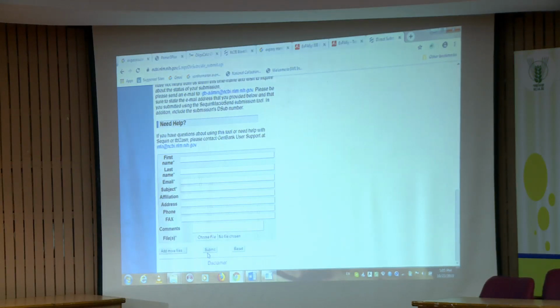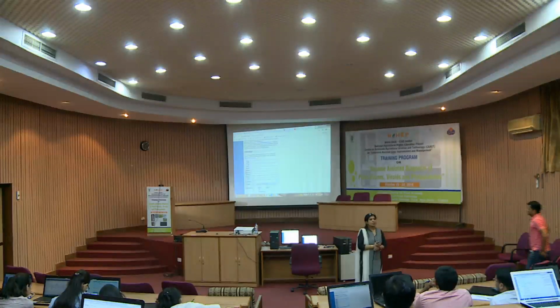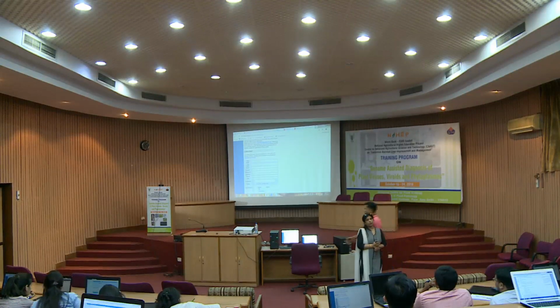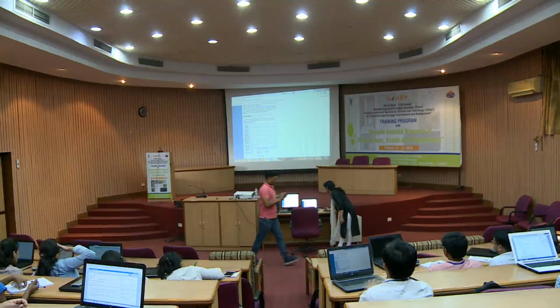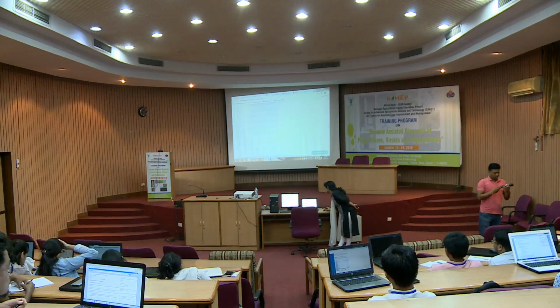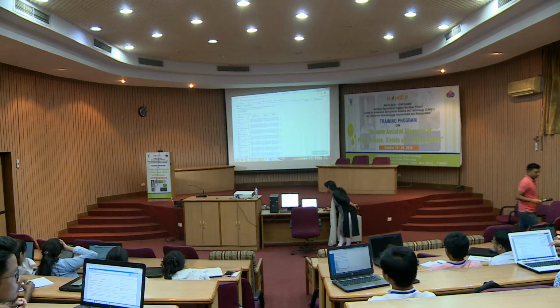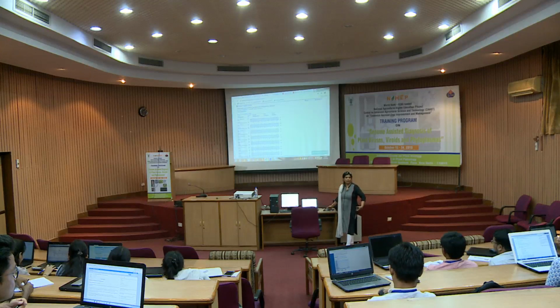Any question? Any doubt? Regions has written nucleotide 1 to nucleotide 230. Yes, we have to type it manually, like I just showed you. You have to actually count it manually, because it will not be highlighted anywhere.